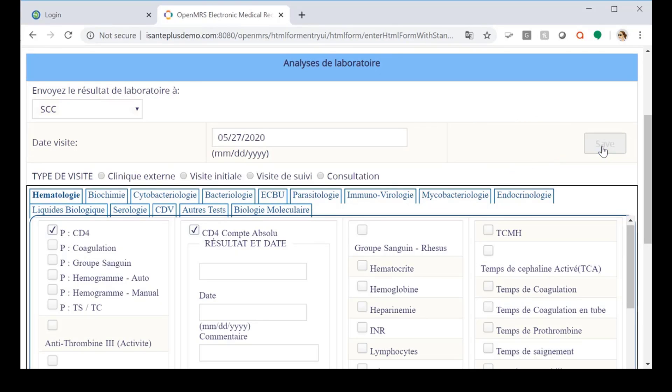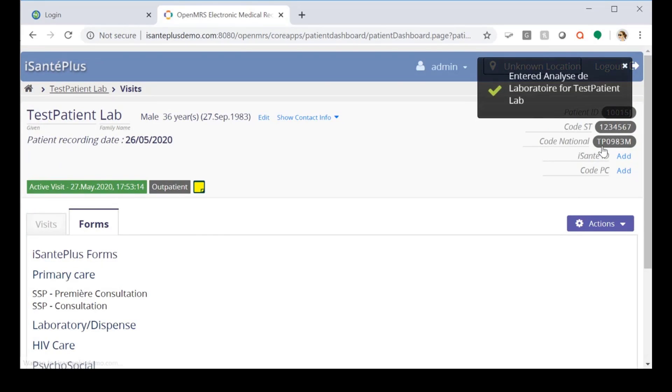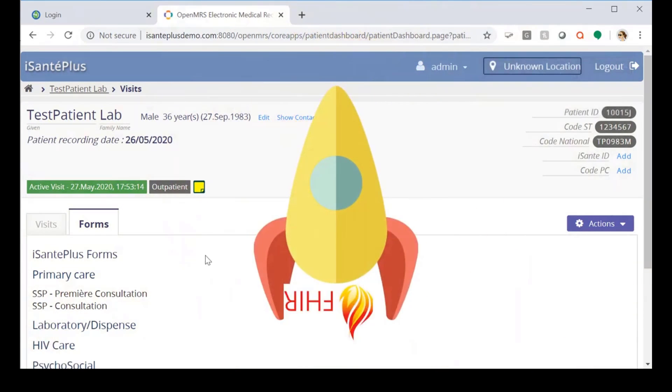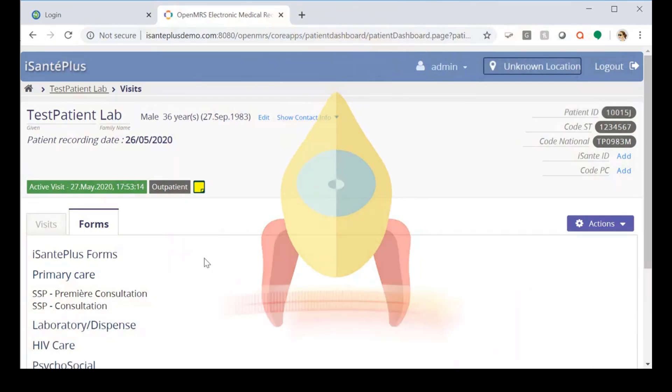When we click save, OpenMRS generates a task resource with all the associated information for the order which OpenELIS can then pull using a scheduled service.